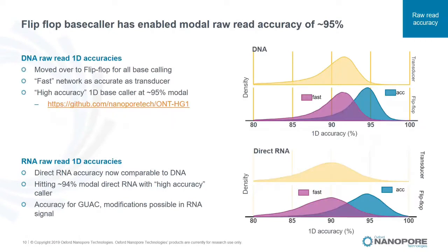And people are always asking about accuracy, because when we released the MinION nanopore sequencing at that time, our accuracy actually was 70 or 80%, and the throughput was less than 1 gigabase. 3 years ago, when I joined Nanopore as technical support, my first line I always said was, if you hit 1 gigabase, you are okay. And fortunately, I could hit 1 giga, but even internally, that was our expectation. But right now, the accuracy and throughput improved a lot. People the first time easily get 5 or 10 gig and more.